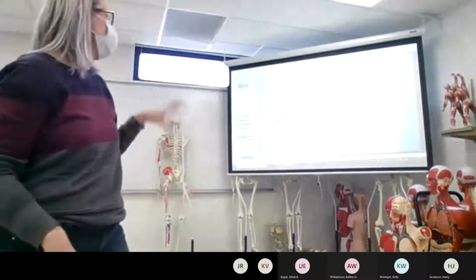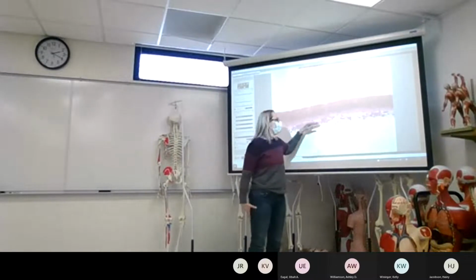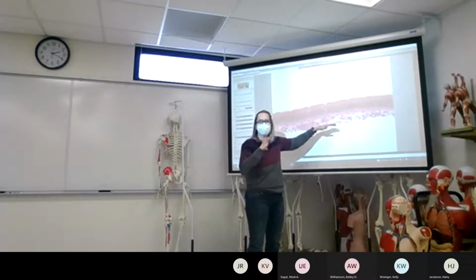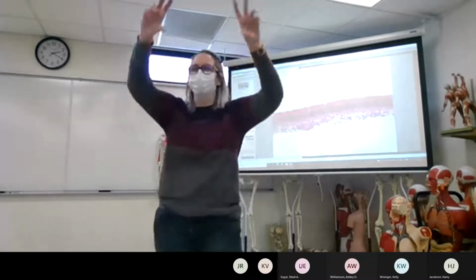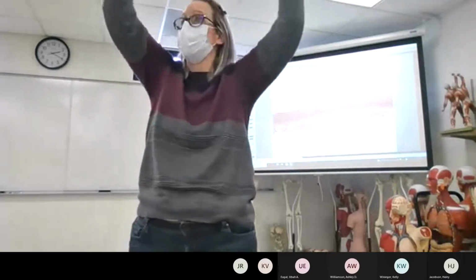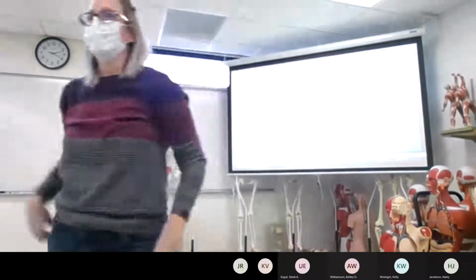All right? And because most of the time it's with the airway, if it's the trachea, later on when we do cartilage, we get a slice of the trachea. So usually a bunch of cartilage will be somewhere around here. And you'll notice that if there's cartilage and it looks like they're arranged in a ring, and then there's an opening and it looks like it's simple columnar, it's really pseudostratified, ciliated columnar. Okay?